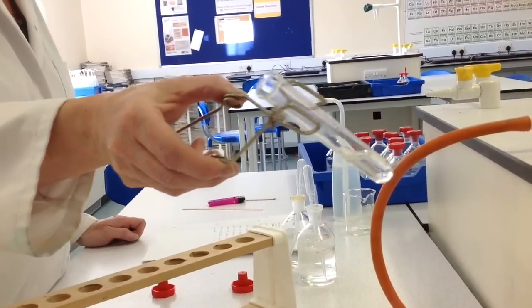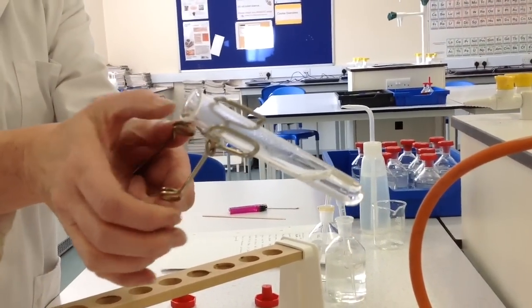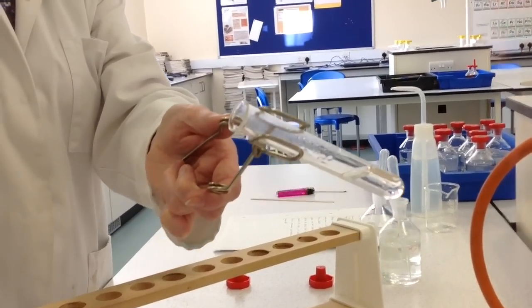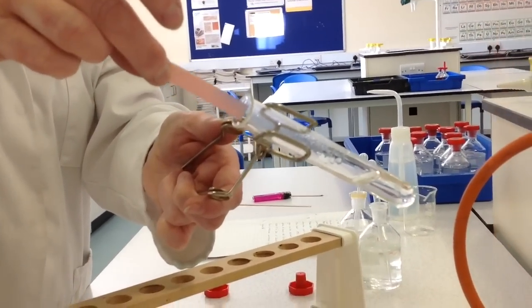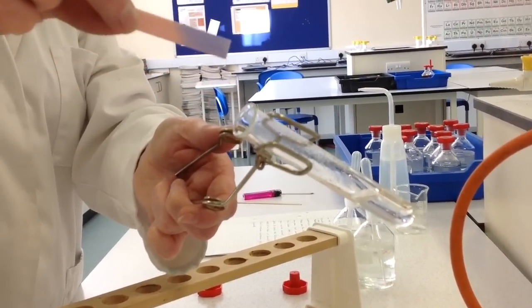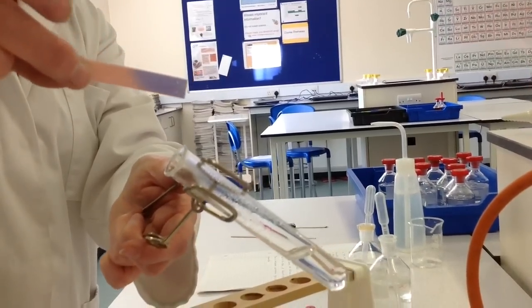Now after a few moments, a gas should be evolved. Now the test for the gas is a damp piece of red litmus paper. If you hold that in the mouth of the tube like that, and you see it's turning blue, that's what ammonia does to red litmus paper.